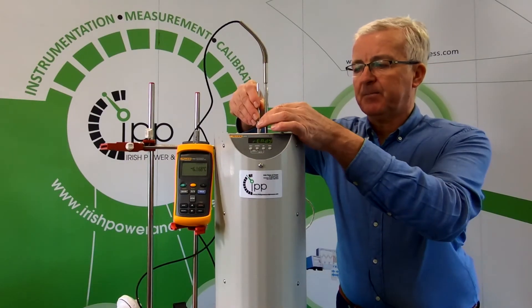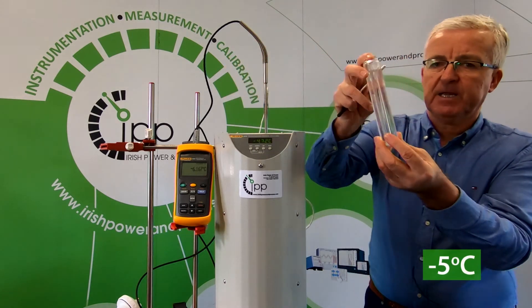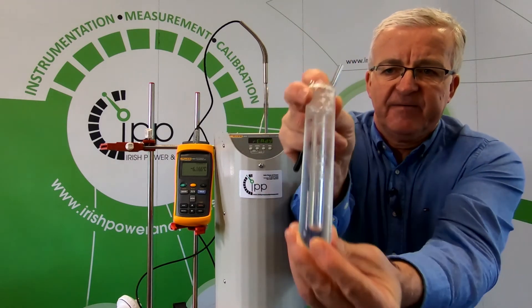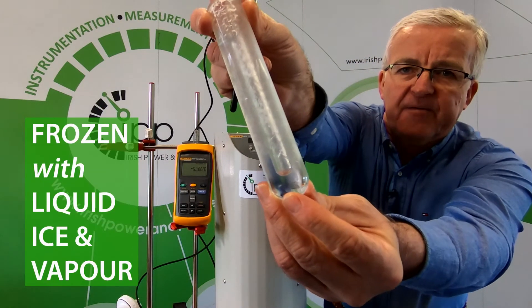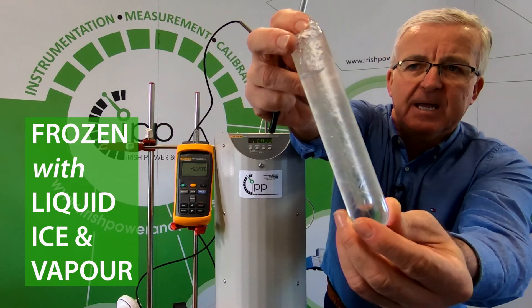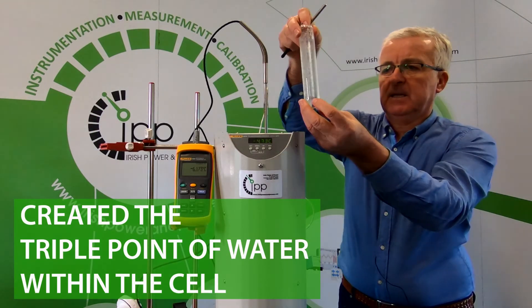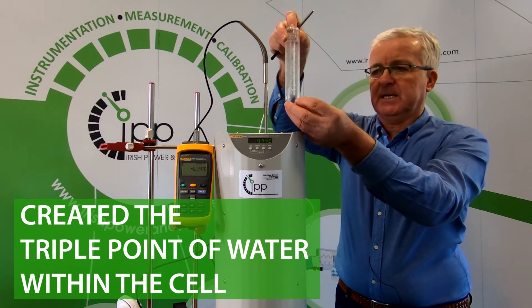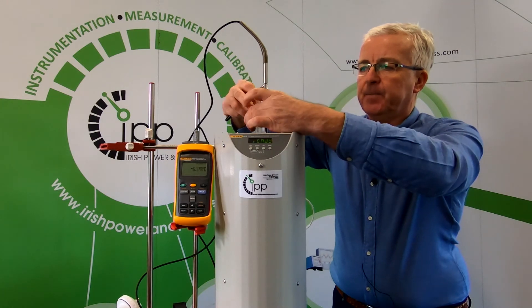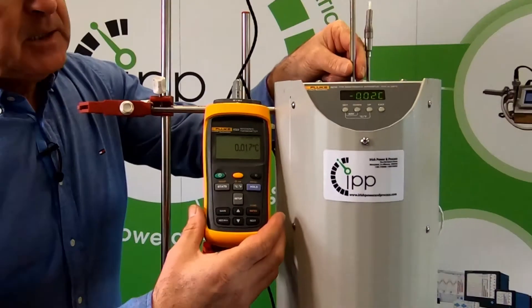The maintenance apparatus has frozen the liquid to minus five degrees centigrade. You can see it is still liquid because it needs a little bit of energy, and now it's frozen with liquid, ice, and vapor. We've created the triple point of water within the cell, defined by the ITS-90 as 0.01 degrees C. We put it back in and now we're going to test all our thermometers to ensure they are accurate.